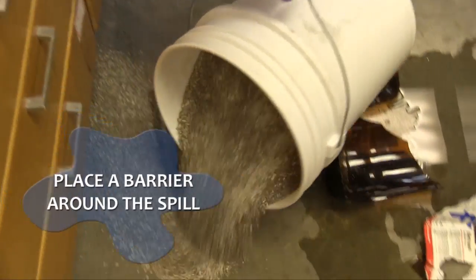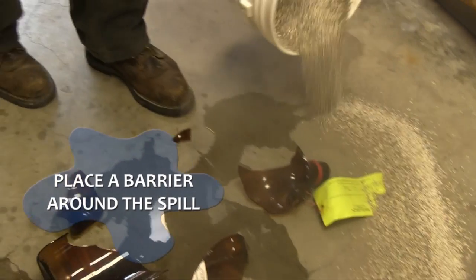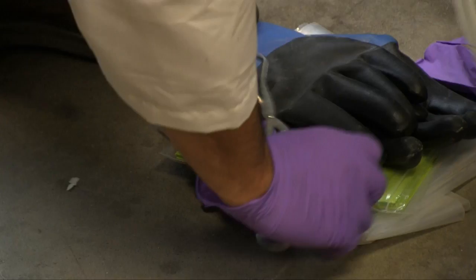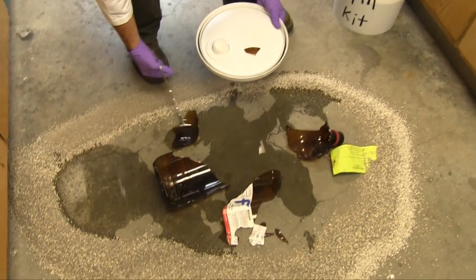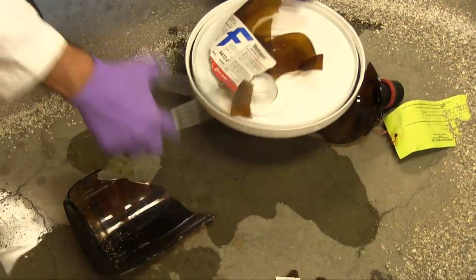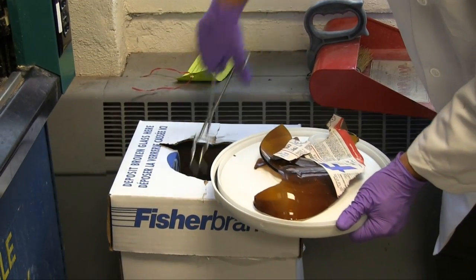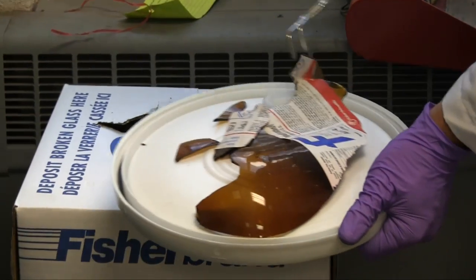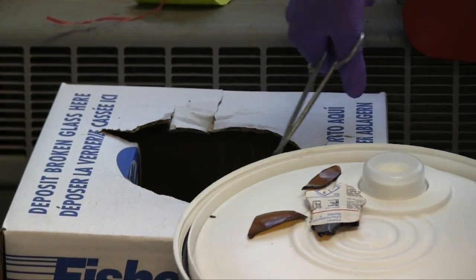Place an absorbent barrier around the spilled material. Use tongs to remove any broken glass from the liquid. If dry, remove the green waste tag from the broken bottle to keep for later use. Place any broken glass into the laboratory glass collection container.